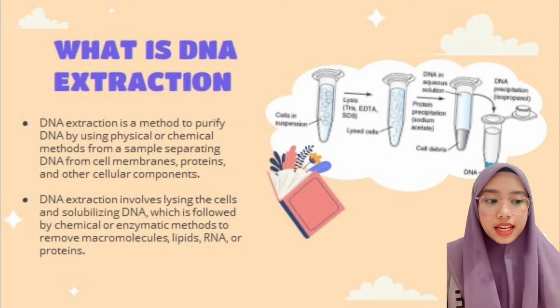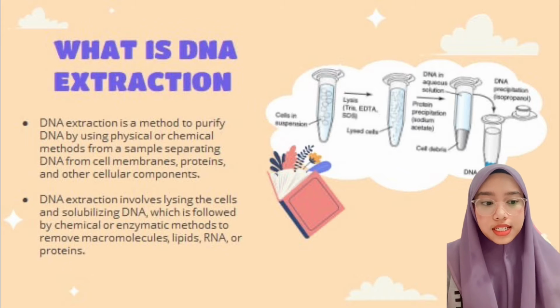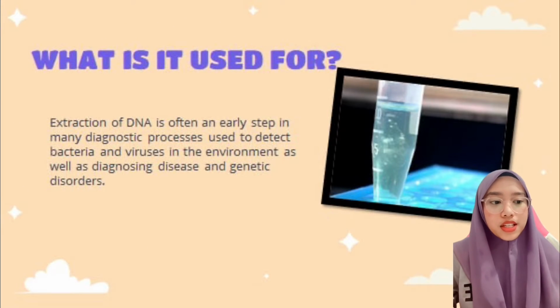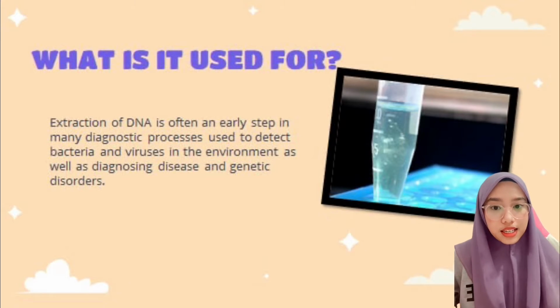Okay, next, DNA extraction involves lysing the cells and solubilizing DNA, which is followed by a chemical or enzymatic method to remove macromolecules, lipids, RNA, and protein. After that, let's discuss the function of DNA extraction. Extraction of DNA is often an early step in many diagnosis processes used to detect bacteria and viruses in the environment, as well as diagnosing disease and genetic disorder.